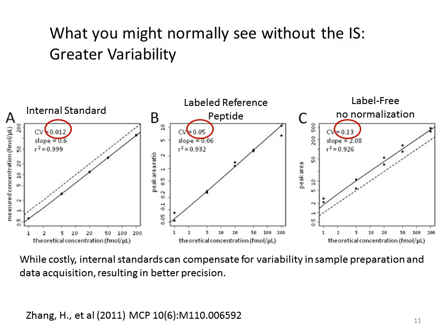And then if no normalization is taken and it's just the raw peak area plotted versus concentration, you see the CV is 13%. So again, same exact peak areas from the light peptide, it's just being normalized differently, kind of like what happens with IRT. You see a bit of a scatter around that regression line, and it gets smaller and smaller as you normalize with an exact internal standard.